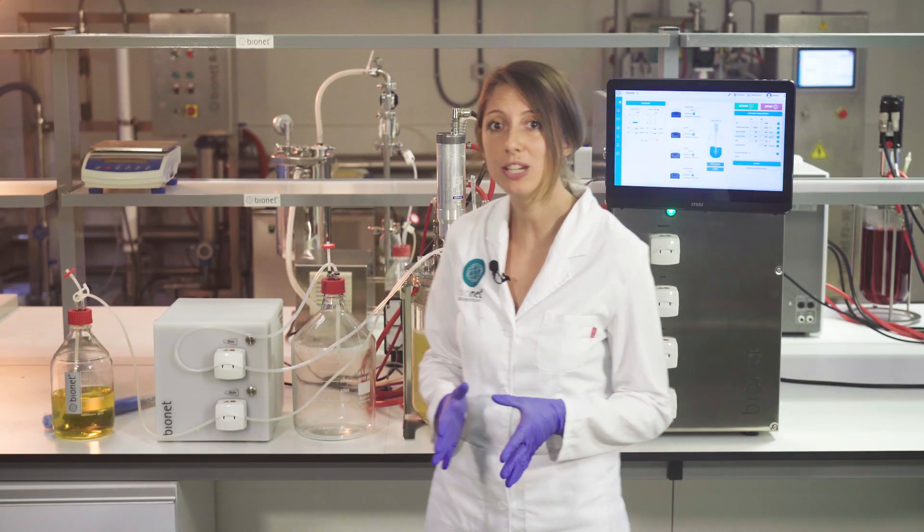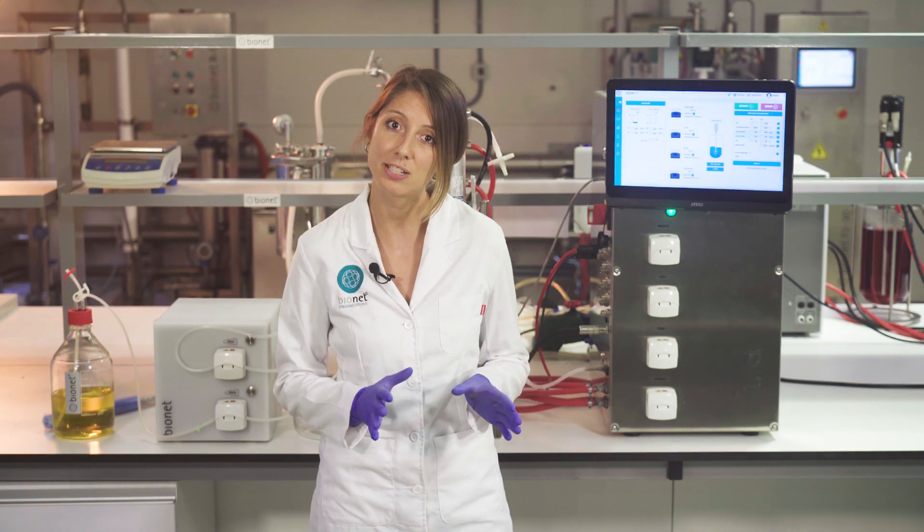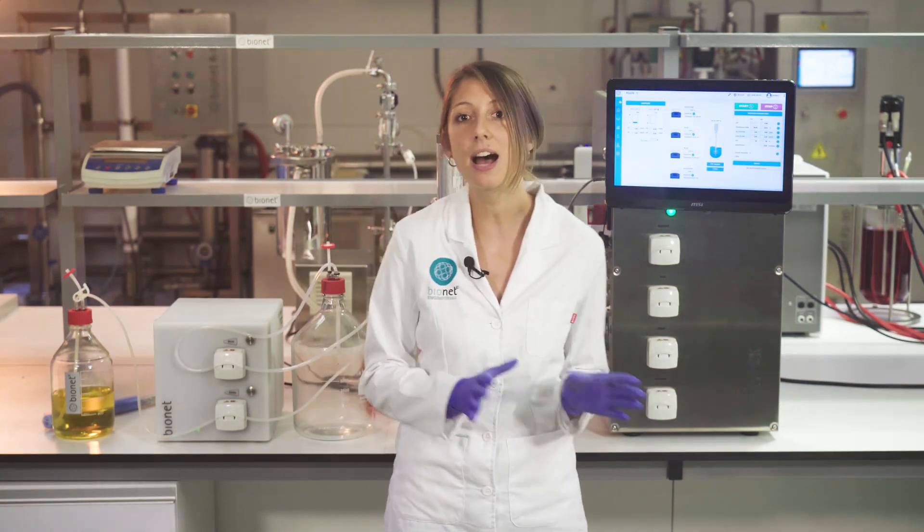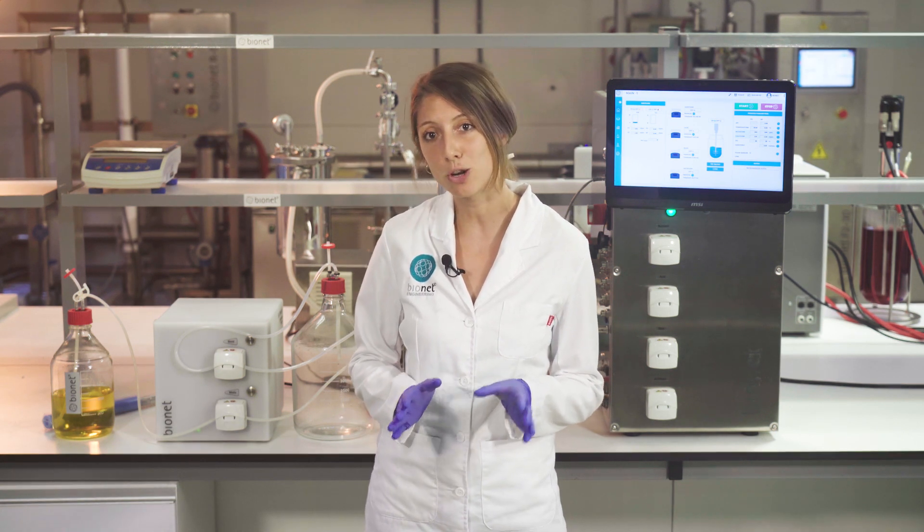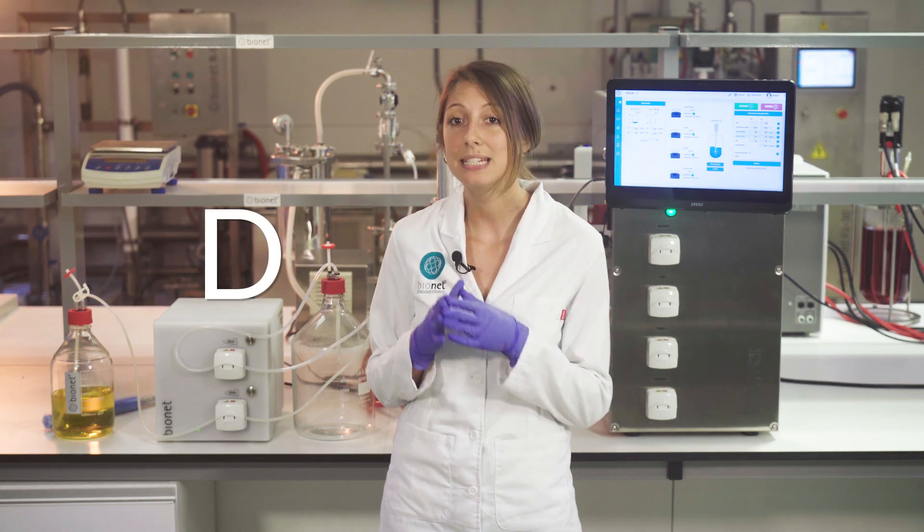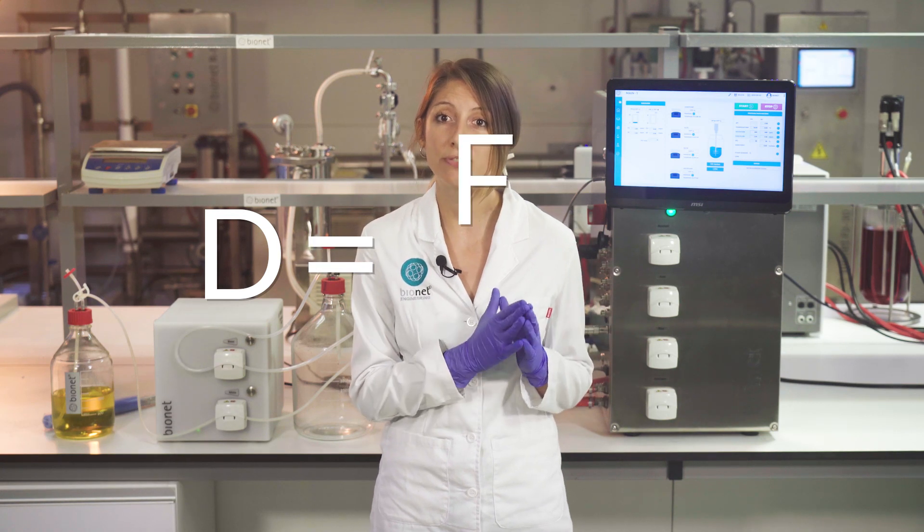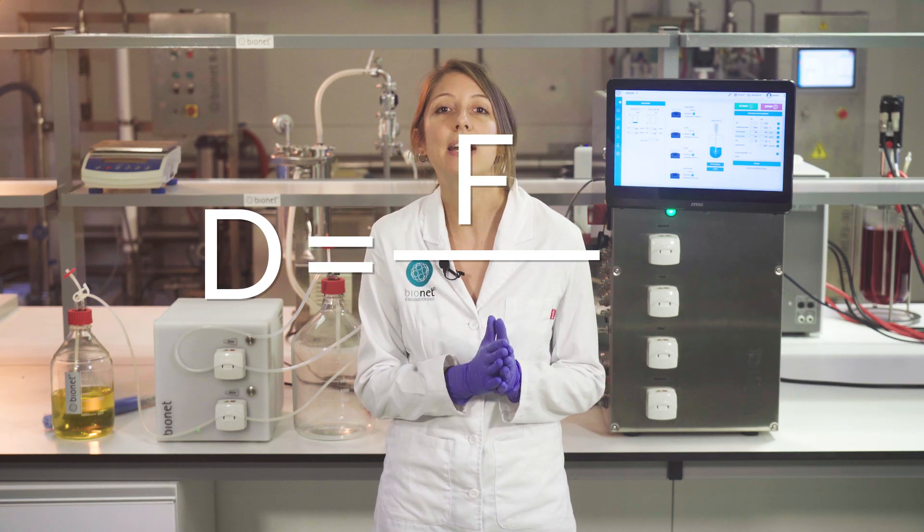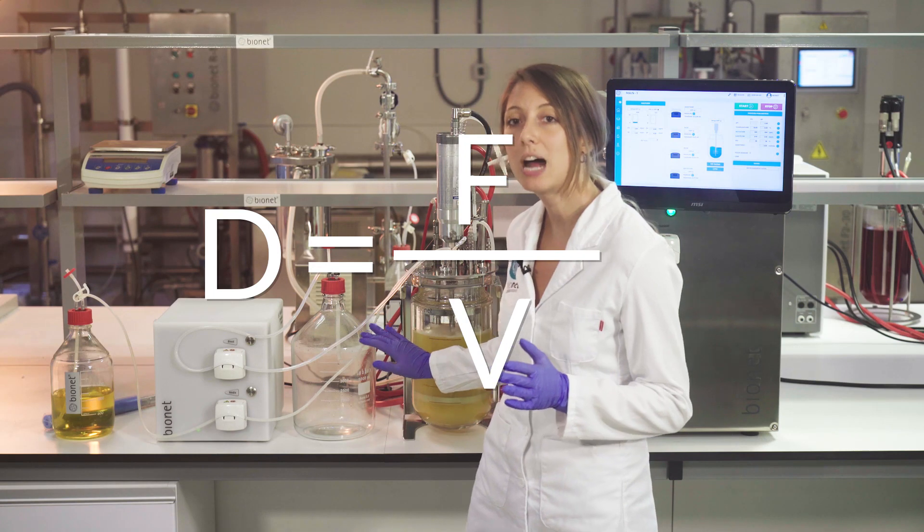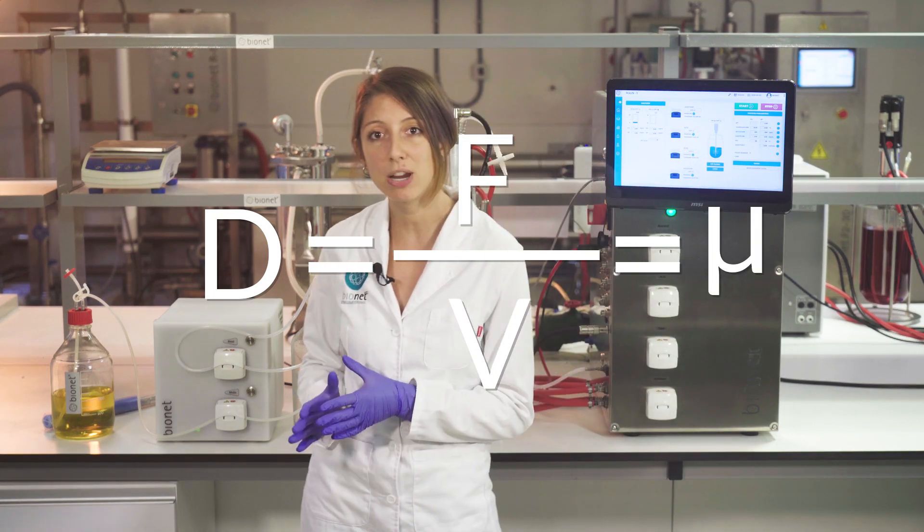This example of a process is using the chemostat strategy with bacteria, and the products of interest are both the living cells and other metabolites in the supernatant. In the chemostat, the user needs to decide the dilution rate that will be used. The dilution rate is equal to the feeding or addition rate divided by the volume in the bioreactor, as well as to the specific growth rate according to the mass balance equation.